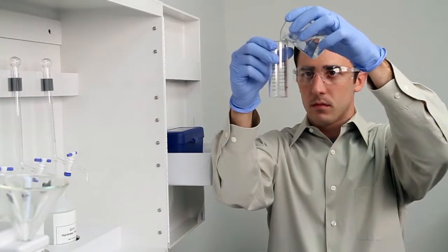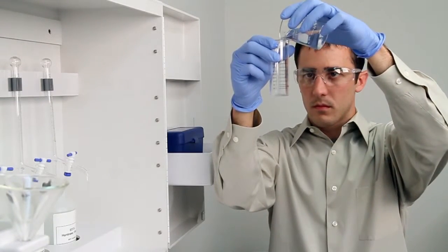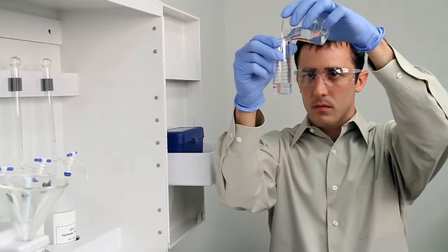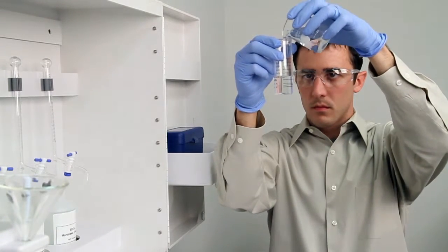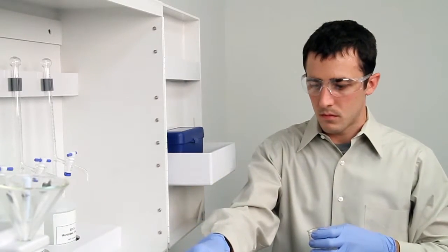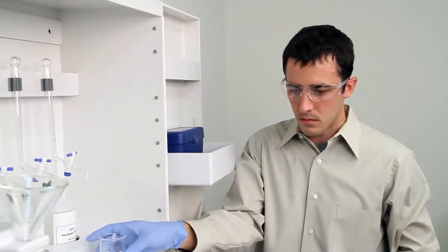To get an accurate sample, hold the vial close to eye level. Accuracy is very important during this step. Once you have an accurate sample, place the vial on a level surface and bend down to eye level to verify.